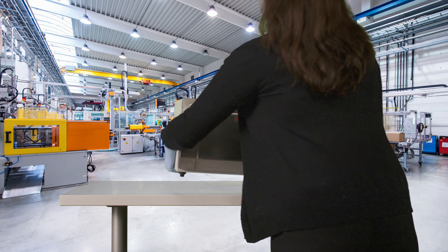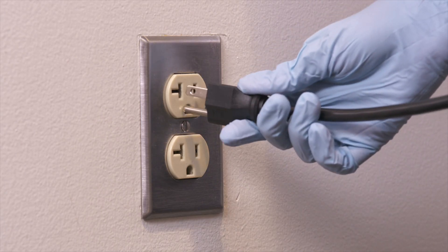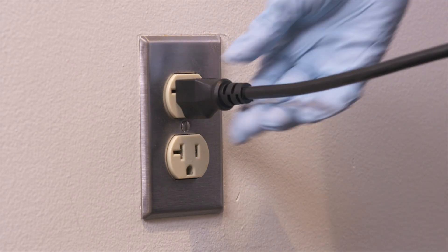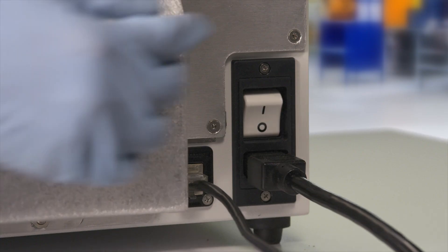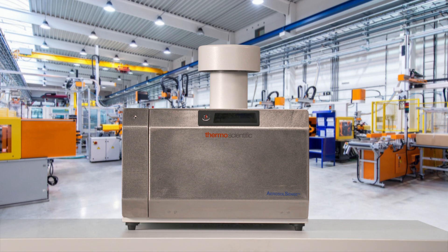First, place the sampler on a flat surface 2 to 5 feet off the ground. Ensure the inlet and exhaust are unobstructed. After plugging the sampler in, toggle the power switch to ON. The sampler is now ready for sample cartridge installation.